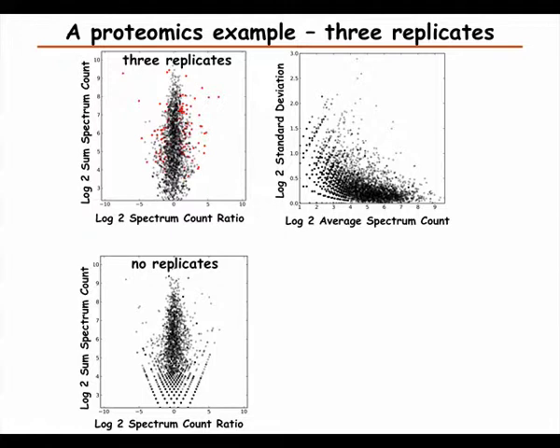Then isn't it less informative if we mix 2 conditions in a sum scale? Yeah, I mean, yes, you mean that if in one case we have a very low, yeah. No, but the idea here would be that one both wants to separate it according to ratio, and then it's just a visual display that we also want to have it separated according to the intensity. And that's why in this case we took the sum. And of course, it will work best for the ones where it's similar. But it's just so that we can separate the points in 2 dimensions, really.